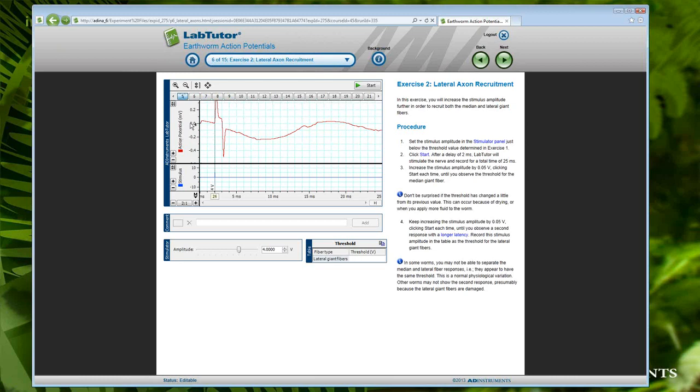You'll see that it looks significantly different. We do have a much longer latency with this worm and this prep, and this is going to be some individual variation that you'll see depending on the species of the worm, how lively the worms are. If you have nice fresh night crawlers, usually you will get a better response than ones that have been hanging around in the fridge for a month. So all of these factors come into play when we use live animal models.